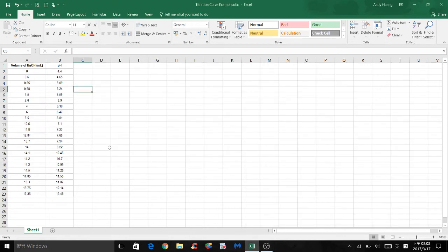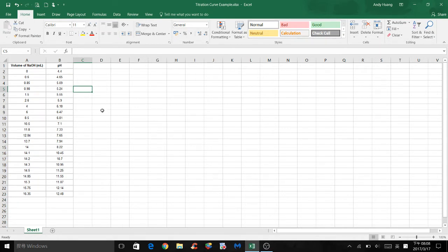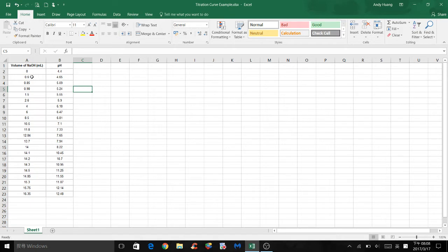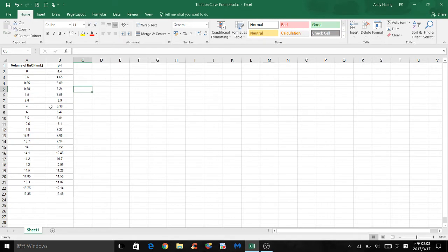In experiment 3, an unknown acid was titrated with sodium hydroxide. To identify the unknown acid, we have to make a titration curve first. Here I have some random values for volume of sodium hydroxide in milliliters and the corresponding pH values at each volume of sodium hydroxide used.